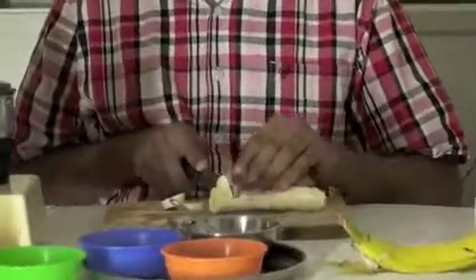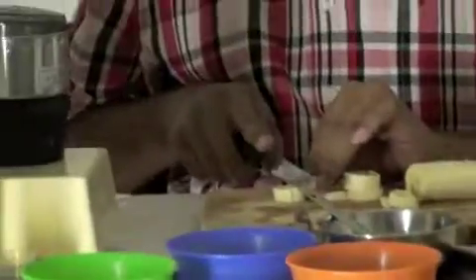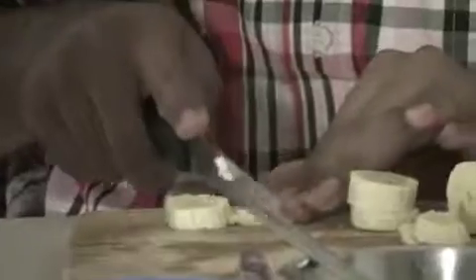It just needs to be enough so that I can put it in the blender. You want small pieces because a banana is a bit more chunky and you want to get it as small as possible. As Aditya said, you want a juice. You want a soup-like material instead of just an ordinary chunky smoothie. The reason behind this is because we want to isolate all the DNA. If we have a really chunky surface like this, we can't really do that. But if you have something smooth, then it's a little bit easier to do it. Also, by doing this, we're separating the different parts of the banana.